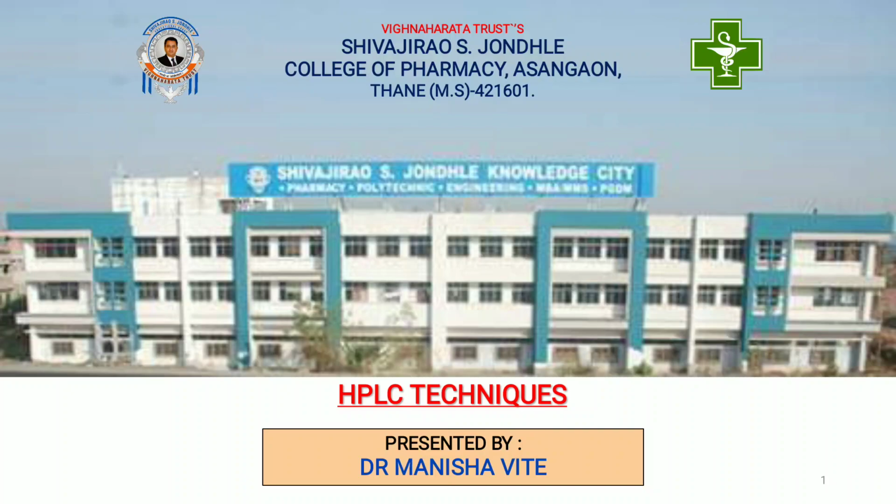Today I am going to discuss a most widely used topic in analytical fields of herbal, natural, Ayurveda, synthetics and many more fields, that is HPLC, means high performance liquid chromatography, or also known as high pressure liquid chromatography.